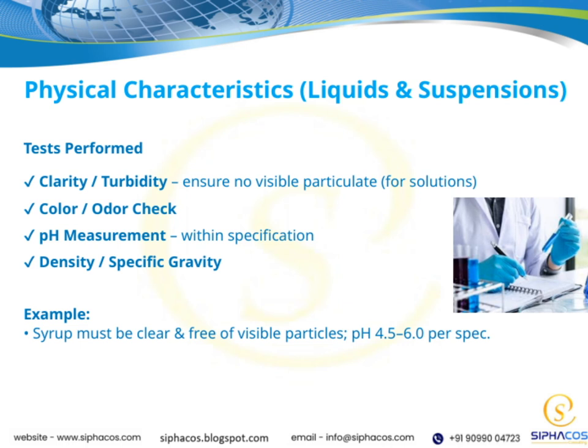For example, a syrup should be clear and free of visible particles, and its pH should be between 4.5 and 6, according to the specifications. These tests collectively ensure the quality, safety, and efficacy of the liquid or suspension before it reaches the patient.